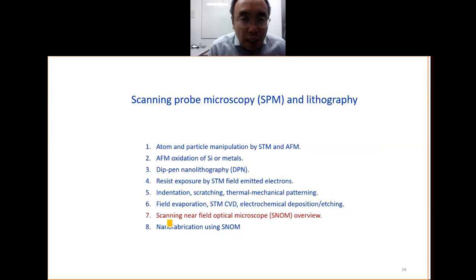So the last topic is the scanning near-field optical microscope. It's called SNOM.